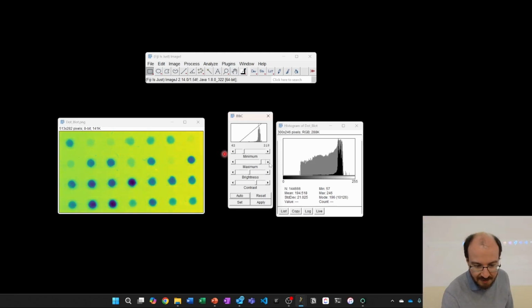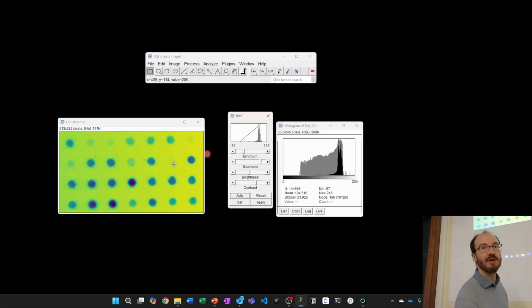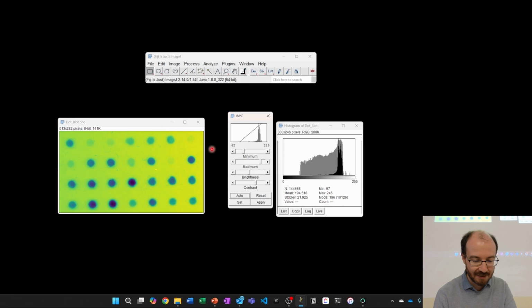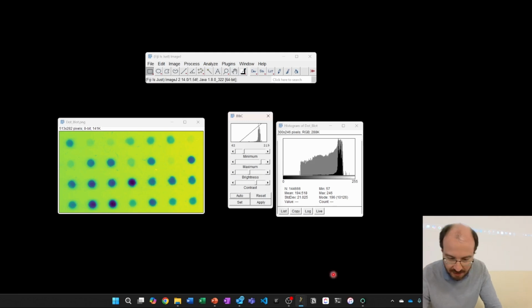I can maybe just turn this up a little bit because I feel like it saturates too much. And now you can also see, I mentioned that little dim structure there. By having more dynamic range available, I can suddenly see that dim structure a whole lot more clearly. But again, just for visualization, this is not actually changing the values, so definitely helpful to do. I'm going to say more on this a little bit later, but I'm going to go back to the presentation for now.